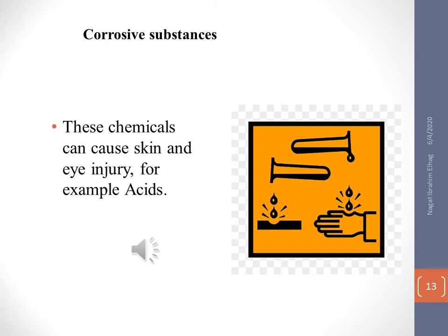you have to know about these substances, and what measure of injury will occur if any accident occurs in your lab, and also what action you take when there is any accident to your eyes or your hands while you are working in the lab.